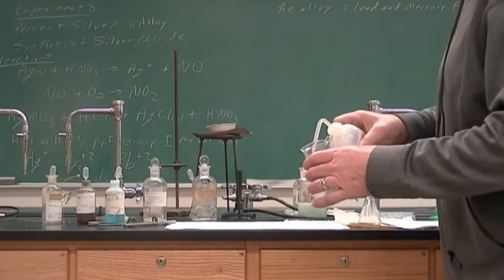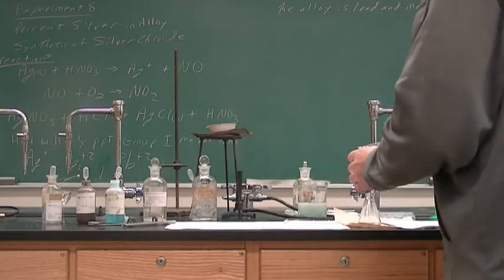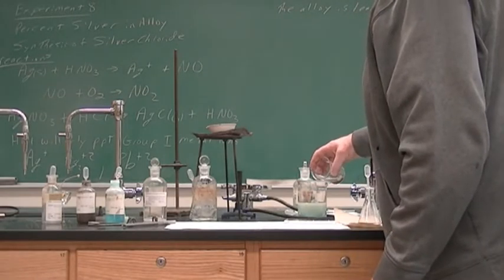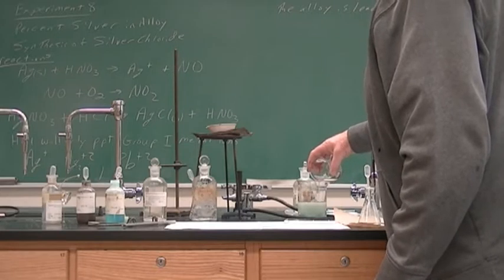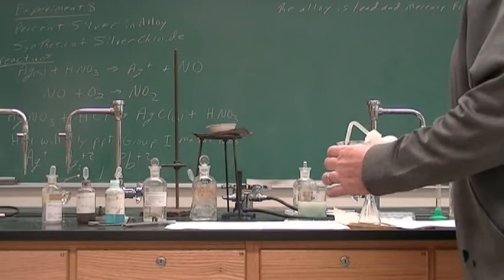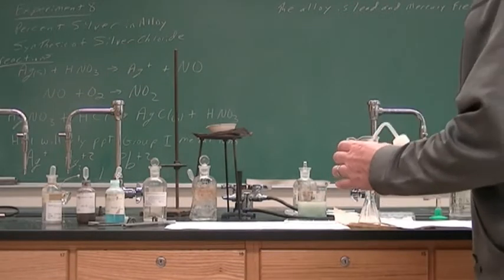Then back to deionized water. All right, then one last deionized water, and then we're going to transfer it into our evaporating dish.